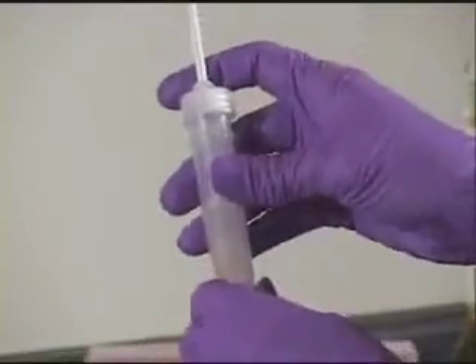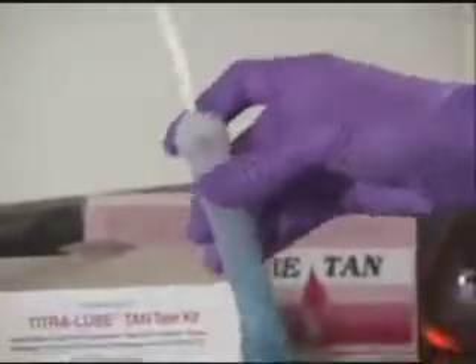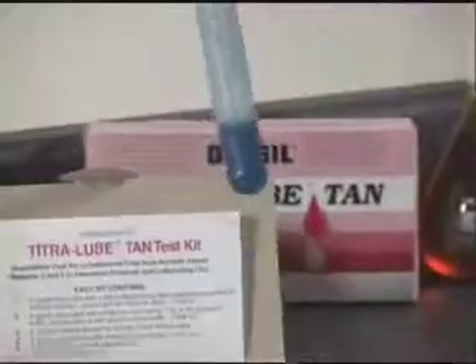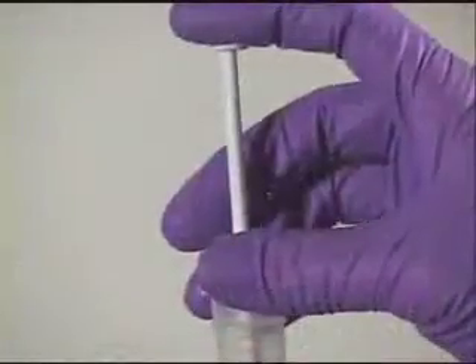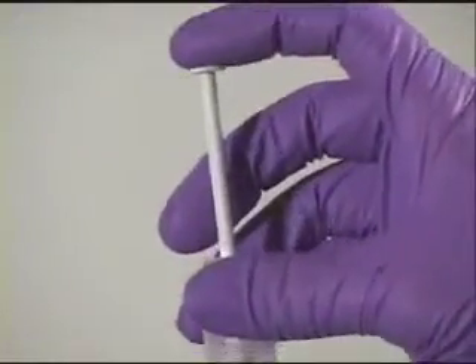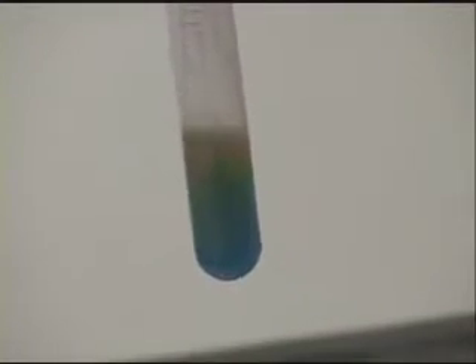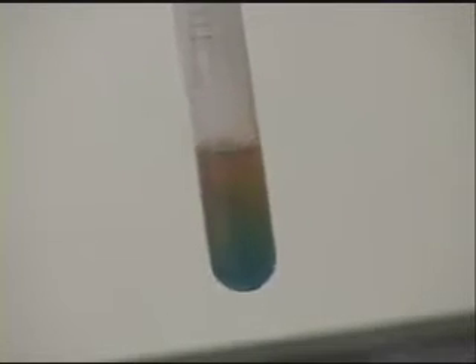Now, add the titrant dropwise to the solution, swirling the solution after each drop. At first, an orange color will appear and disappear rapidly. When the orange color appears and fades away slowly, you are getting close to the end point. Add each drop slowly, and when the blue color turns bluish orange, add one more drop of titrant. The color should be bright orange — stop.